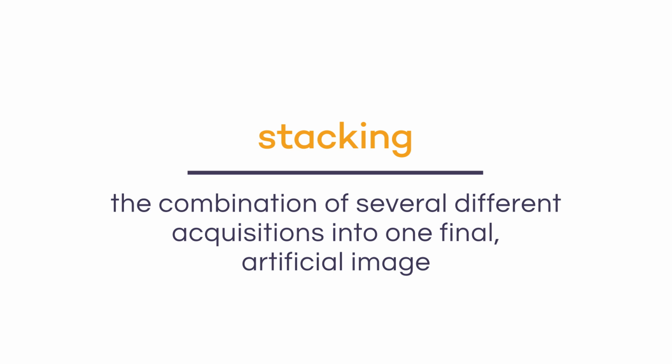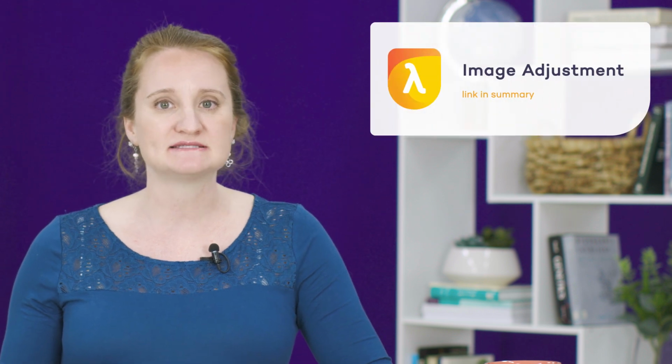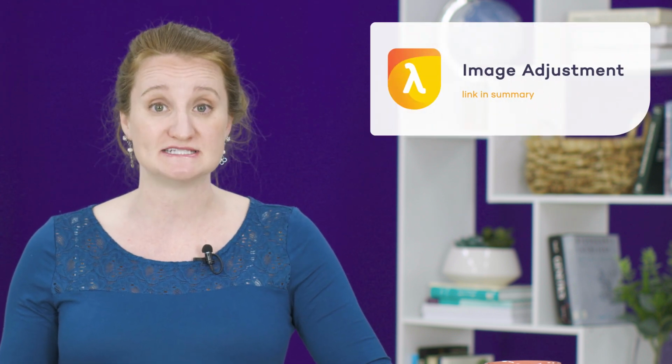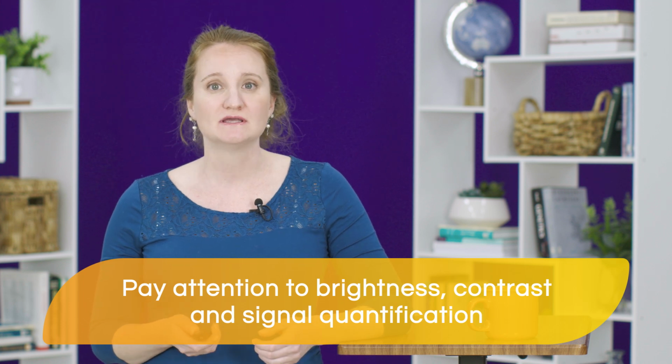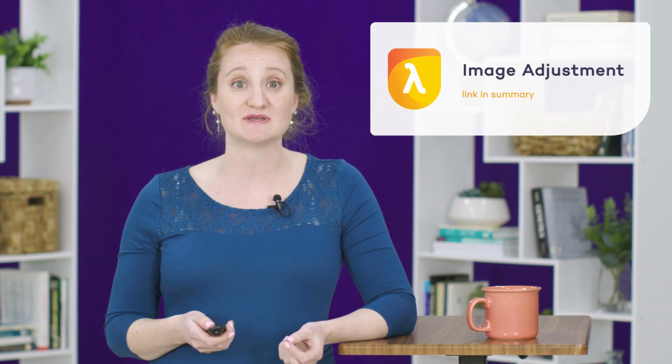Stacking images combines several different acquisitions into one final artificial image. We will discuss binning and stacking in the image adjustment course in further detail. Both of these acquisition settings are forms of image manipulation. They are properly addressed in contemporary publication guidelines for Western blot data, and they should be avoided. When analyzing your blot, be mindful how the software handles these adjustments. Specifically, pay attention to the brightness and contrast and signal quantification. It's really easy to unintentionally introduce error during the image analysis. For more information on this, refer to the course on image adjustments.